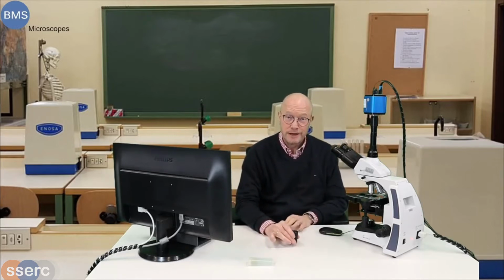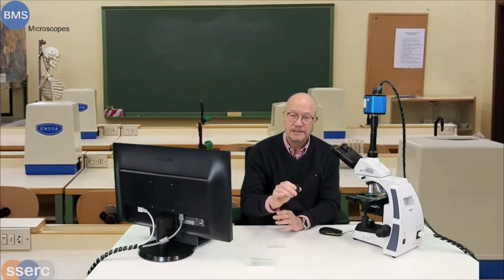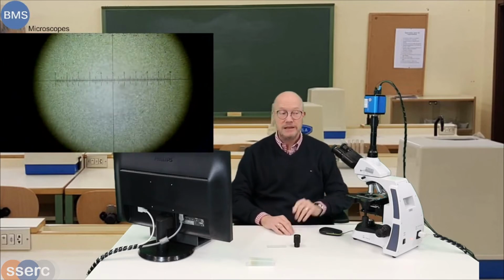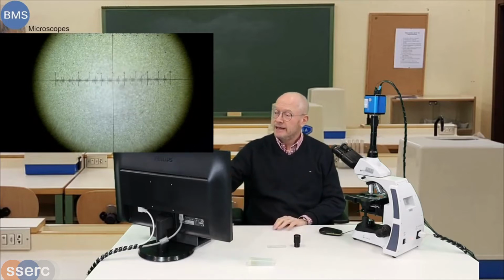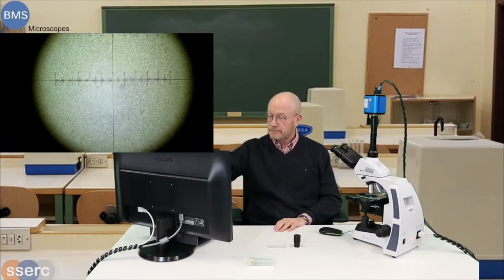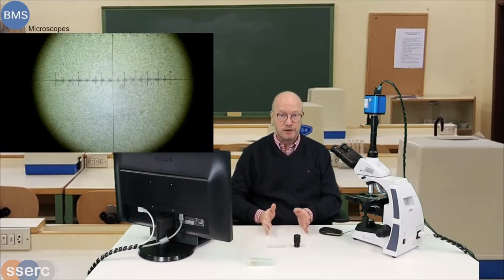It's the main part of doing a measurement with a microscope, but for that you need 2 other items. You need an eyepiece with a built-in graticule. It's a kind of ruler, as you see on the screen here. This is the camera. This is the ruler inside the eyepiece. The eyepiece is in between the camera and the microscope. And here you see a scale starting from 0 up until 10. It's divided in 100 parts, so each number is 10 parts, altogether it's 100 parts. There's not a unit to it.